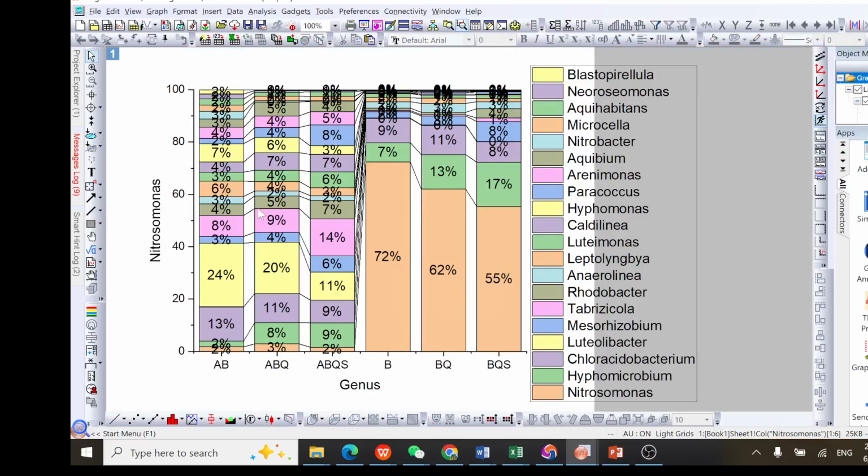So you have this figure. You're saying we have to purify this figure to get to the taste of what you want. So to do that, just click on this connection. Click on them twice. Right click twice. Sorry, left click twice.